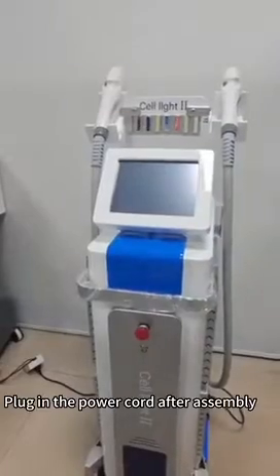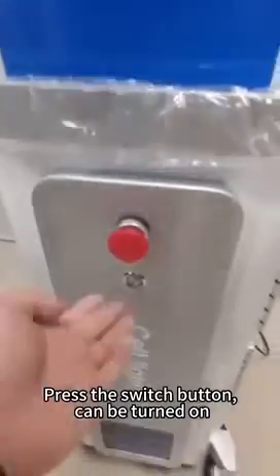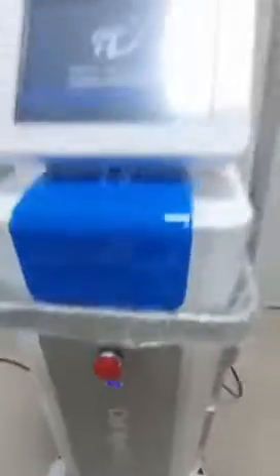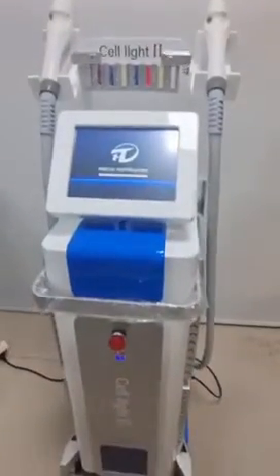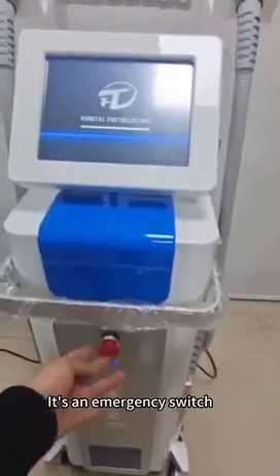Plug in the power after assembly and press the switch button to turn it on. In case of an emergency, there is an emergency switch.